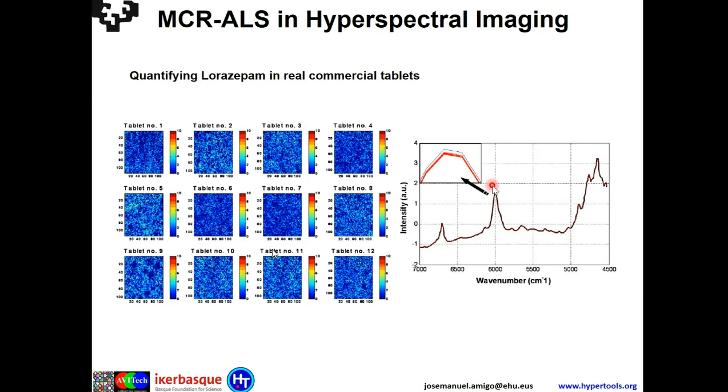And what astonished us is that the match between the real spectrum here in black and the calculated spectra in red was extremely high. And that actually is a kind of validation for us to know that, oh yes, what we are seeing here corresponds to lorazepam indeed. Okay?